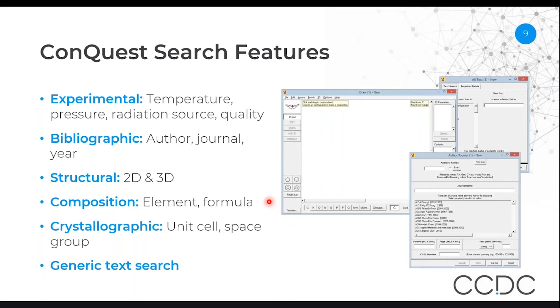You can search based on simpler terms such as the composition — so anything that contains certain elements or has a certain formula — crystallographic terms such as the size of the unit cell or the symmetry properties. We also allow for generic text searching, so if you're interested in entries which contain certain words such as natural products or the like, you're able to do that quite easily with the interface as well.